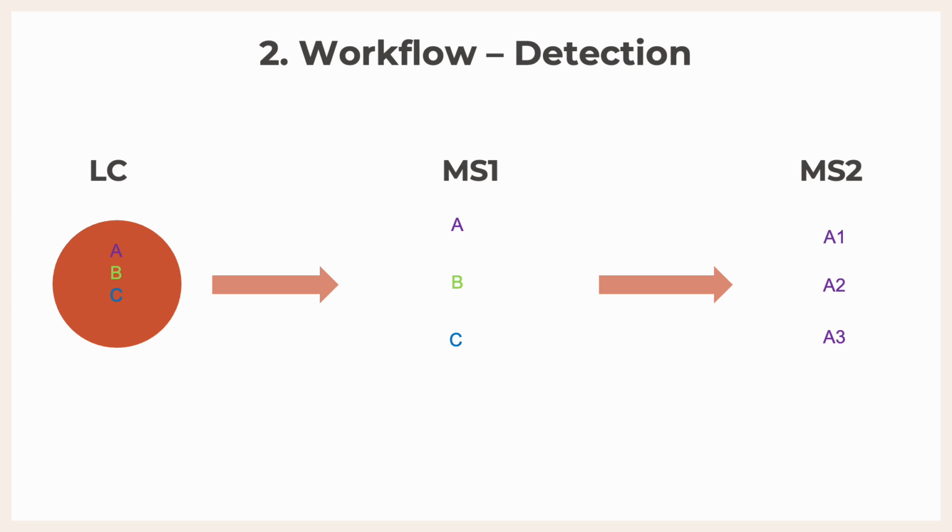So you could break it apart as many times as it physically allows. Just for the sake of this example, we're going to go for 3. And keep in mind, this MS2 will also happen for B. So you will also get B1, B2, B3, and then C1, C2, C3, CN, right? Until you're physically unable to break it apart anymore, because of physical chemistry.